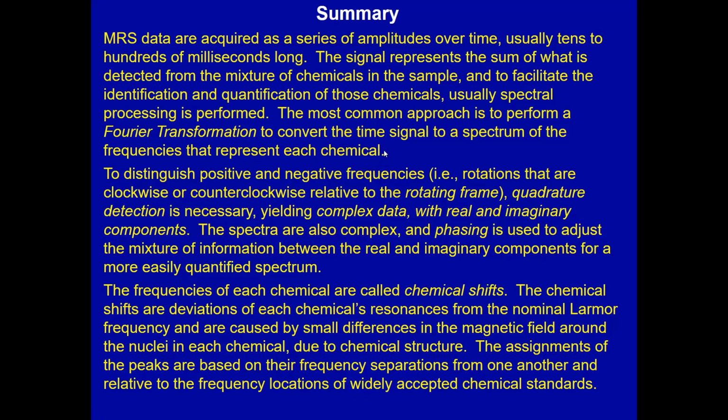So our raw signal has units of time, or 1 over millimeters. It becomes millimeters. This lecture focused mainly on spectroscopy, but the same principle applies in imaging. Now, we also introduced the concept of positive and negative frequencies, which, as I stated, is bizarre in regular life. But really, it's a matter of relative frequency.